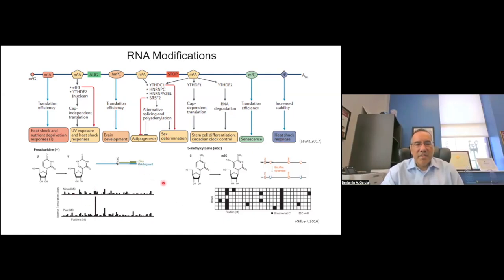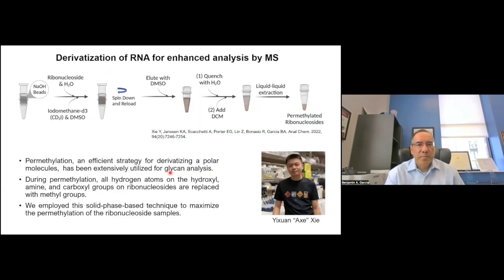And we've seen a lot of great technology advancements in genomics to identify and quantify a lot of these modifications. But as many in this symposium feel, mass spectrometry definitely can play a big role complementary to genomics for characterization of post-transcriptional modifications on RNA and looking at combinations of modifications on RNA transcripts as well. So I'll talk a little bit about some of our efforts to improve the global analysis of RNA. We've already seen a lot of really great work.